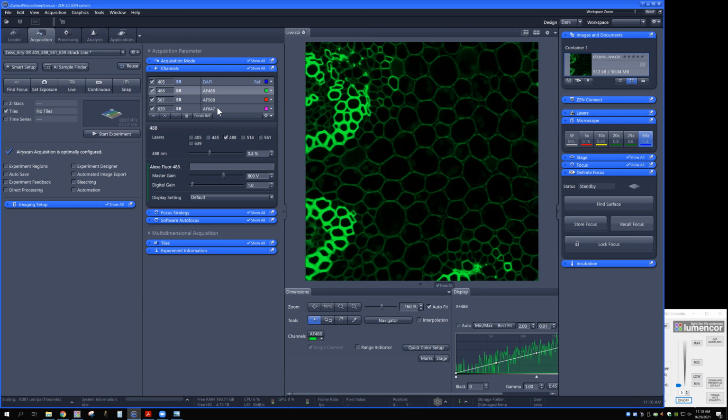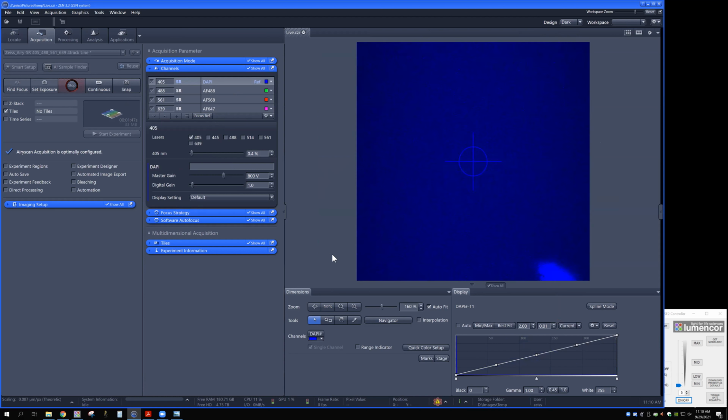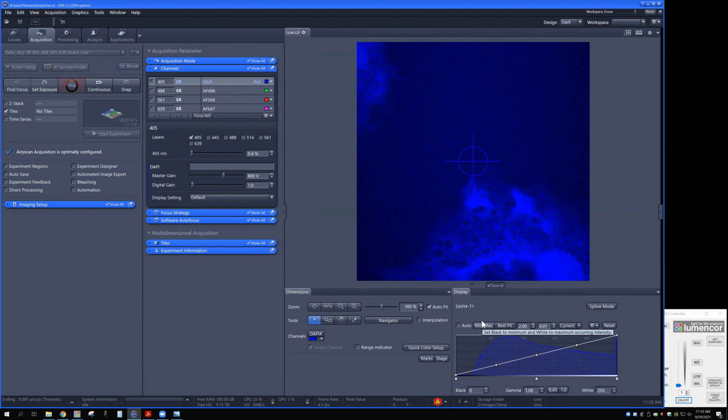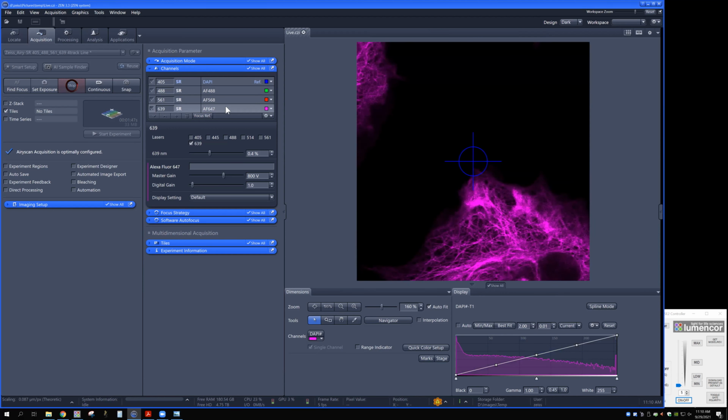Definitely 647. Okay. Definitely DAPI. Okay. Maybe for 488 and 555. Okay. I'll start then with DAPI and 647. We'll see what we got. And all right. Okay. Even the DAPI is weak, is it? Oh, there we go. It's kind of gross. And there's a lot going on with that, isn't there? Yeah, I mean, I might be exciting more stuff, but yeah. Yeah, gorgeous, that's pretty. All right.